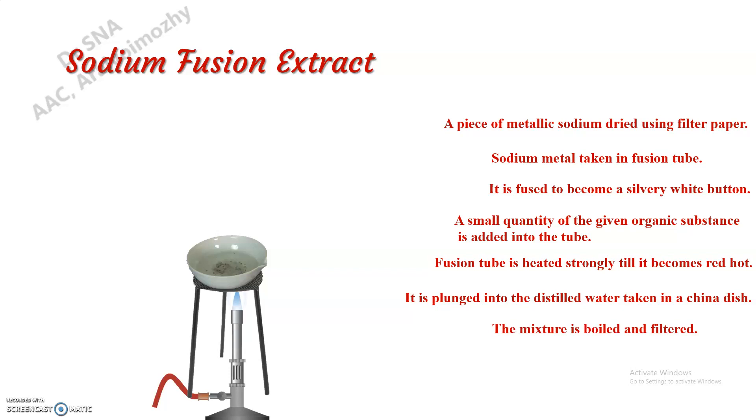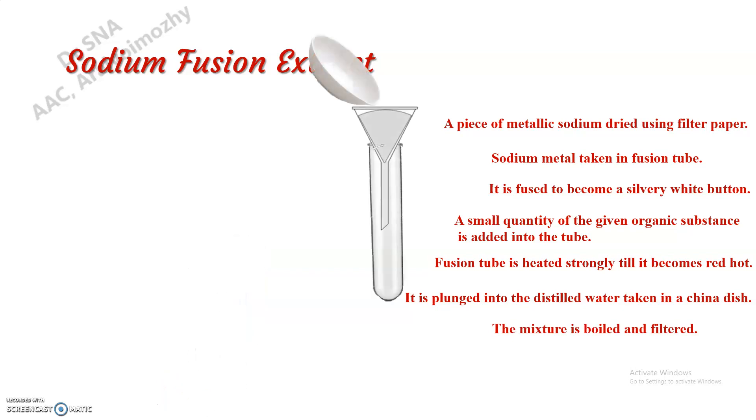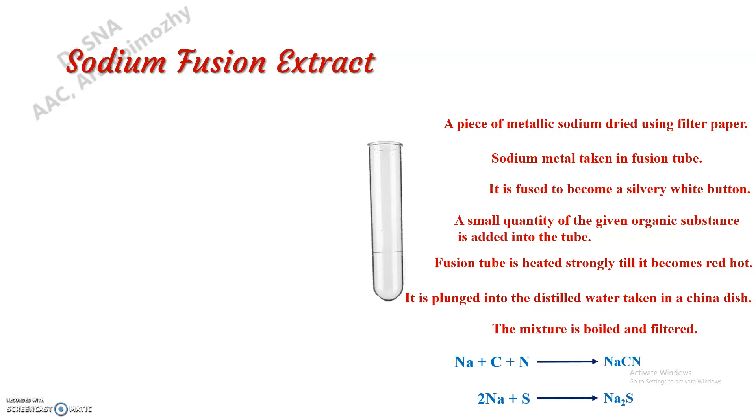We have to grind this mixture well using a glass rod, then boil this, and after boiling you have to filter it. This clear filtrate we call the sodium fusion extract. By fusing our substance with sodium metal, the sodium is combining with carbon and nitrogen, or with sulfur.